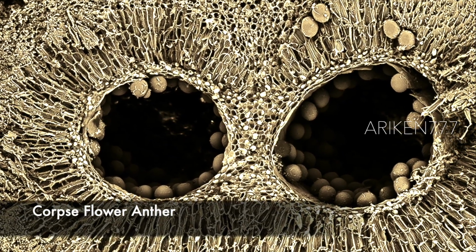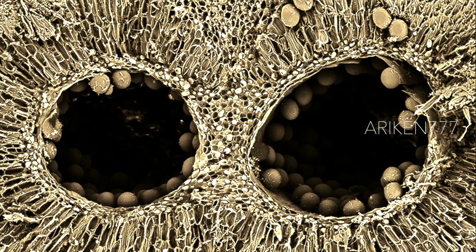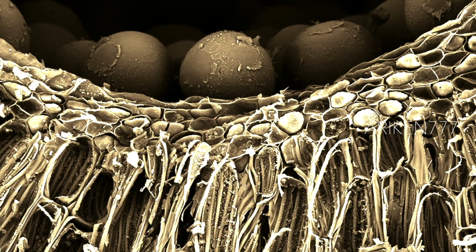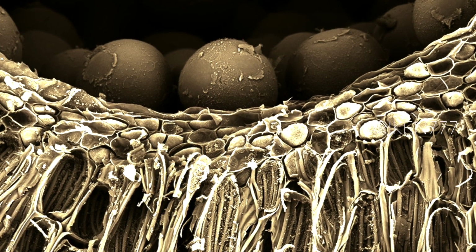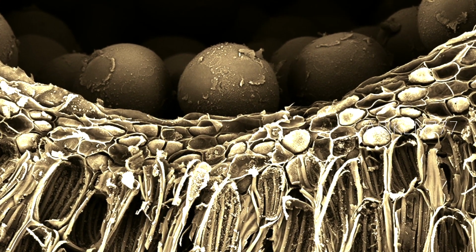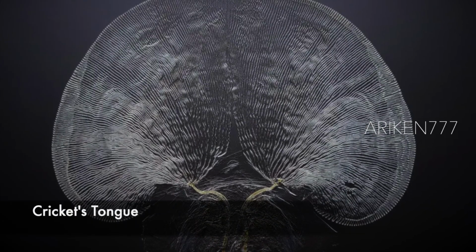Anther of Titan arum or corpse flower, showing the locule, the cavity where the pollen is located. The Titan arum is a flowering plant that has the largest unbranched inflorescence in the world and smells of rotting flesh. A cricket's tongue.